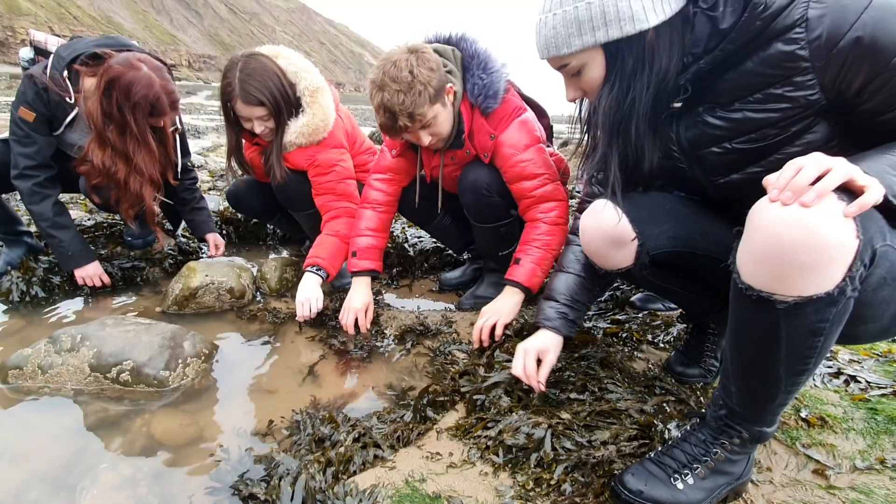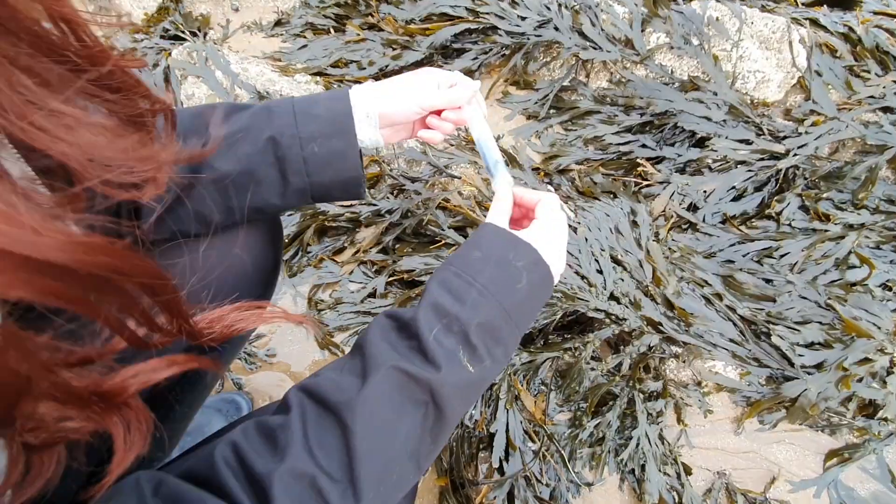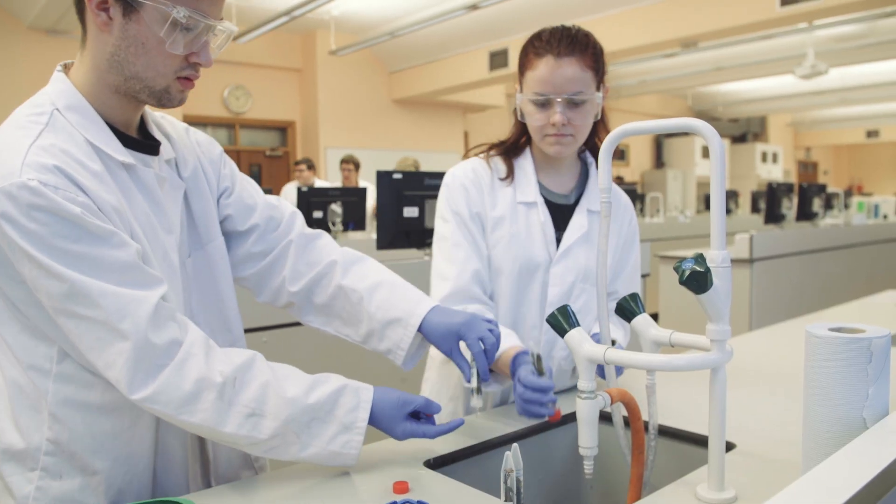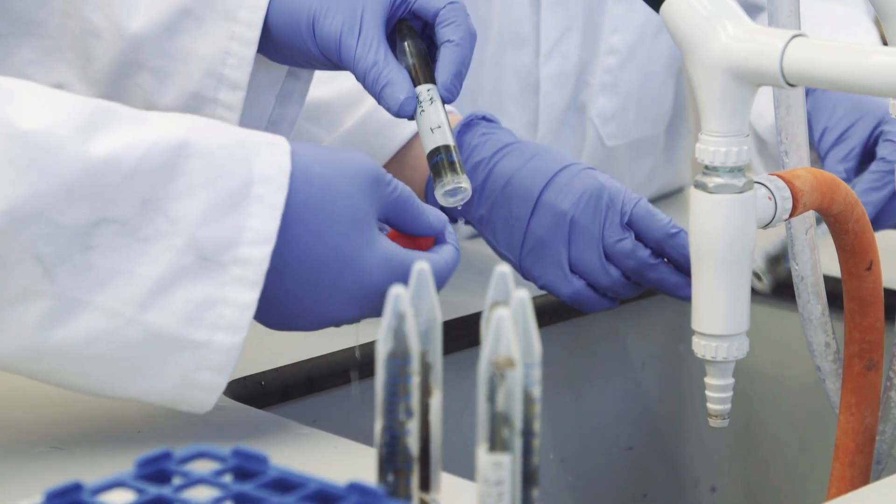Yesterday we collected seaweed from the beach — from high shore and low shore — and today we're going to test the pigments in each of them to test the amount of light that they absorb. They should absorb different amounts and different types of light from the different water levels that they're used to. We're adding acetone to the seaweed samples.